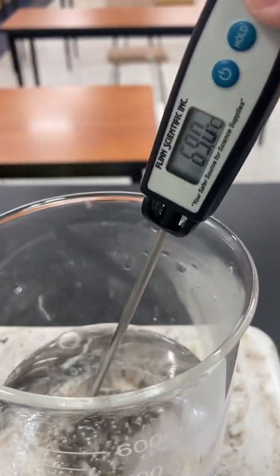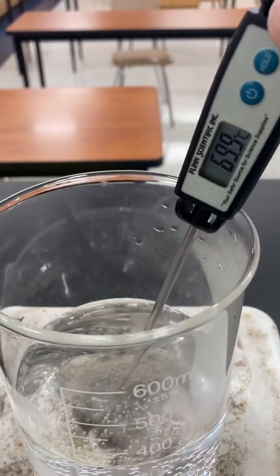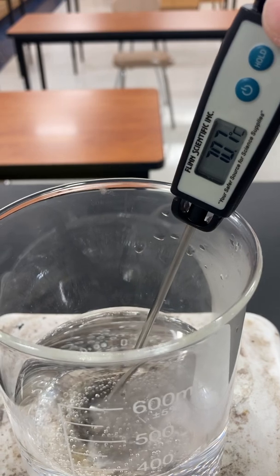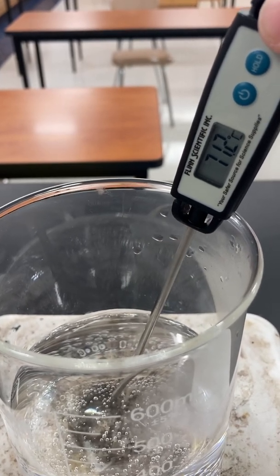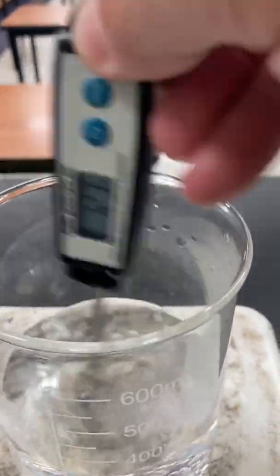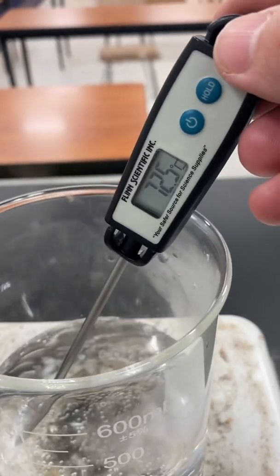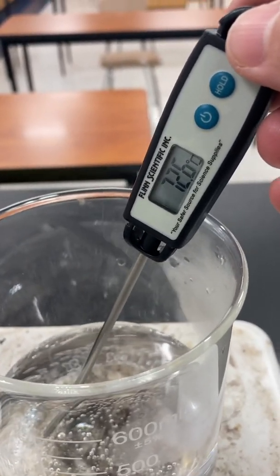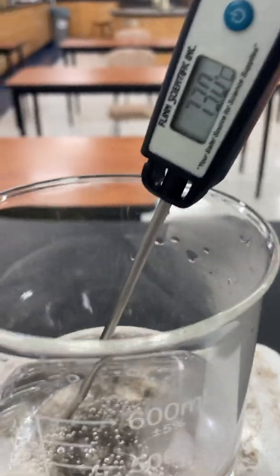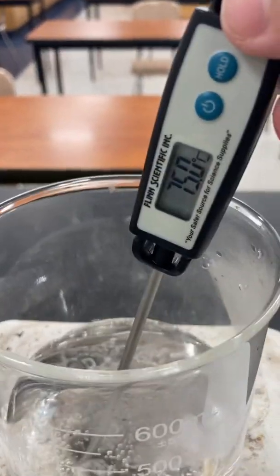Remember, by the time I even start reading it, it's already going up again, so you just got to kind of do your best here. Okay, you know what? I can start seeing some steam building up on the side of my beaker, and I can also see steam coming out of it. Okay, at 9 minutes, it was like 74.2 degrees Celsius.